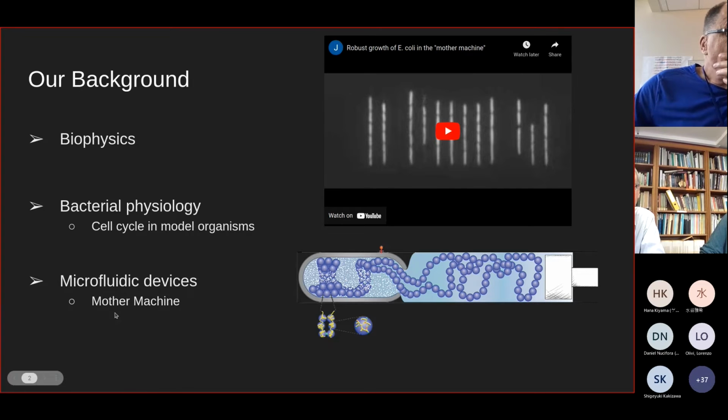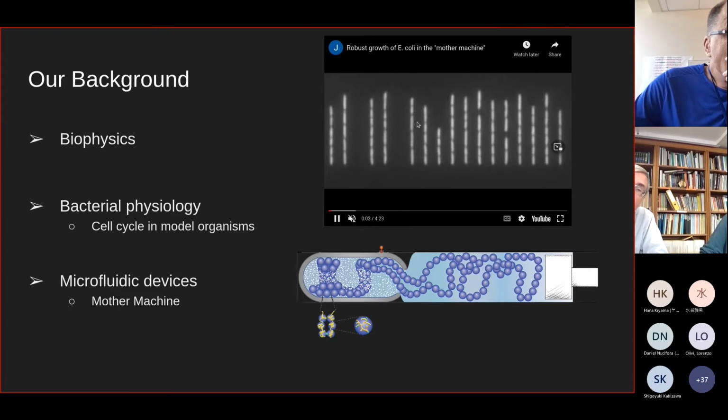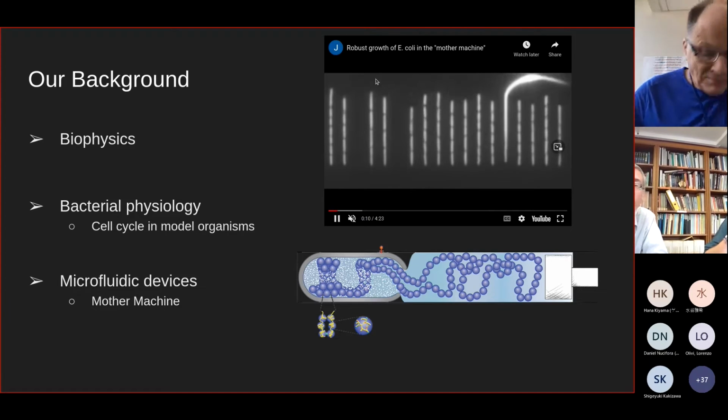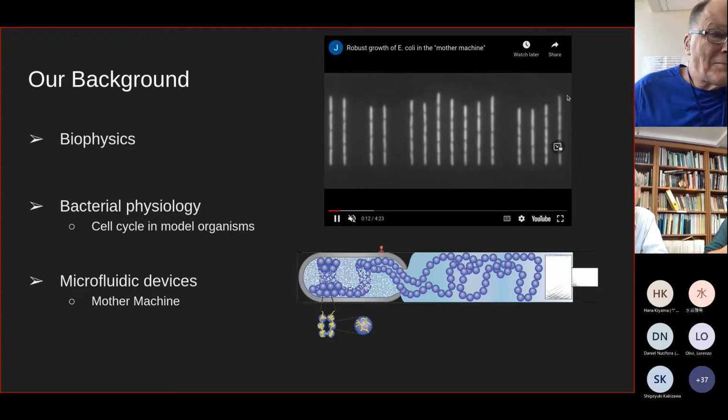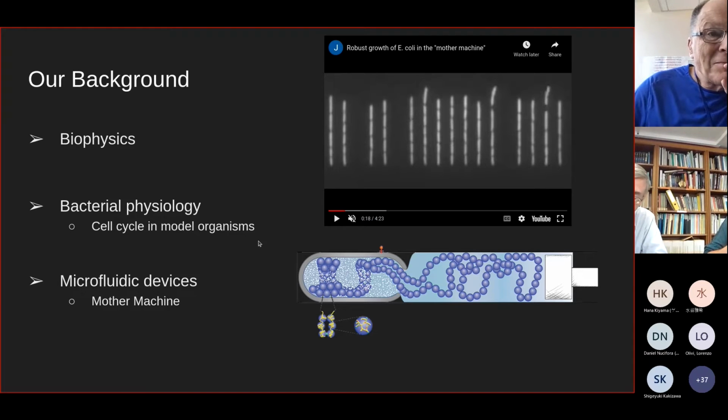Generally, one of our primary experimental techniques is the mother machine, which is a microfluidic device. You have probably seen these, but I've got some footage from one, where basically we load E. coli into some kind of channel, and then we have a strong fluid flow up top, providing nutrients. And we can watch cells grow for very, very long periods of time under very tightly controlled conditions.